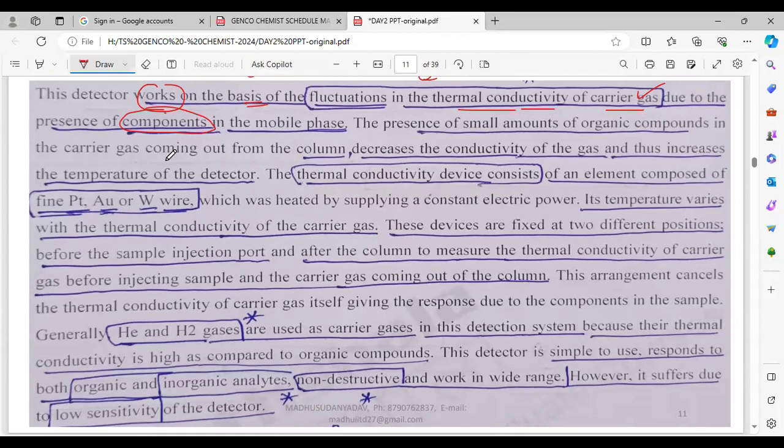Okay. On the result, you are having 2 or 3, 4 different types of heats. If there are some organic components in the sample taken, it decreases the conductivity. This is a general assumption after a number of repeated experiments, they observed that if a decrease in conductivity is observed, you can conclude that it is an organic compound.